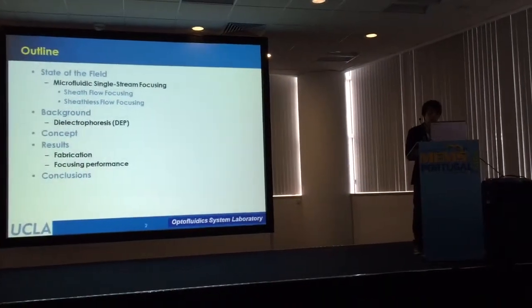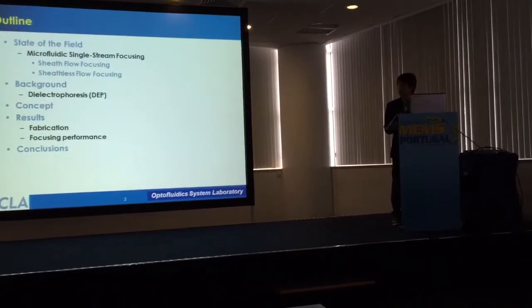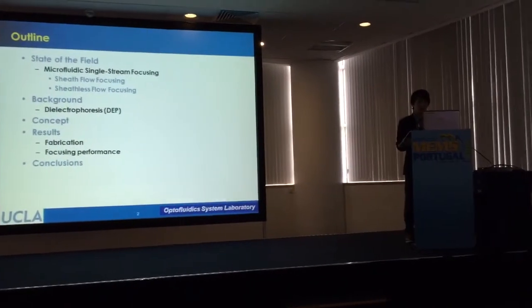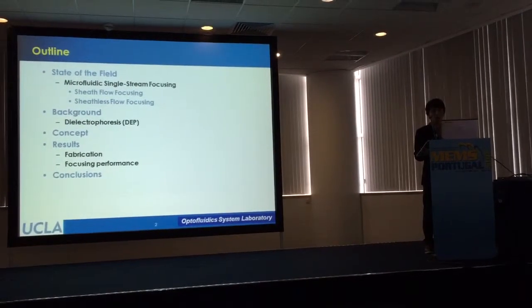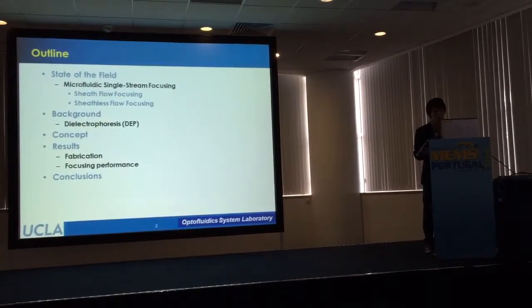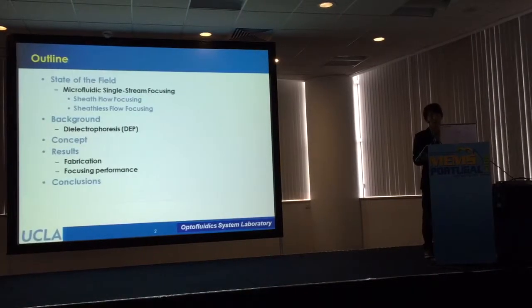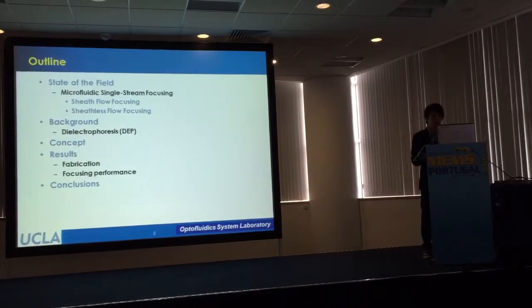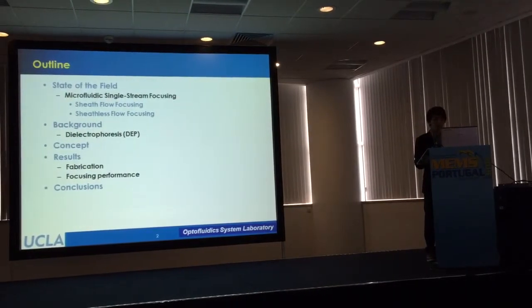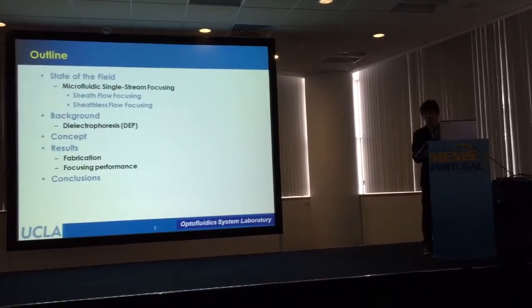The outline of this talk starts from reviewing the state of the art in microfluidic single-stream focusing, which will include sheath flow focusing and sheathless focusing. Then basic background on dielectrophoretic forces will show how this technique is used in sheathless focusing. At the same time, the key problems that have trapped researchers for years will be pointed out. Then the design concept of how we solve the problem will be proposed. After that, the results will show how to fabricate the device and show the focusing performance. Finally, I will come to the conclusion to conclude this talk.